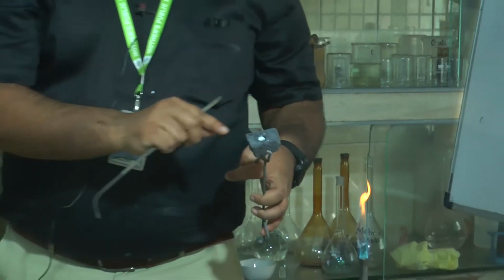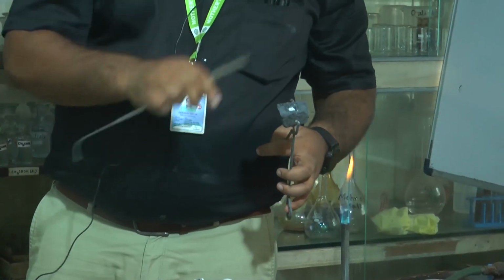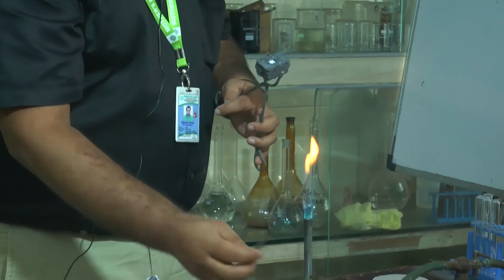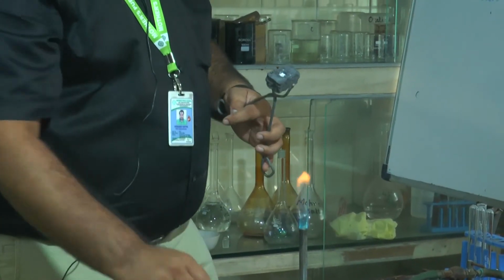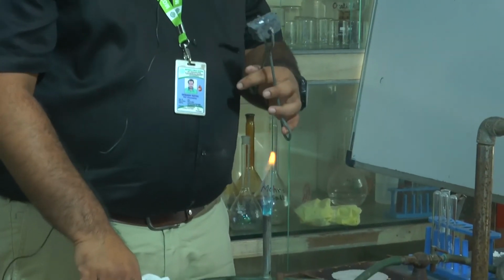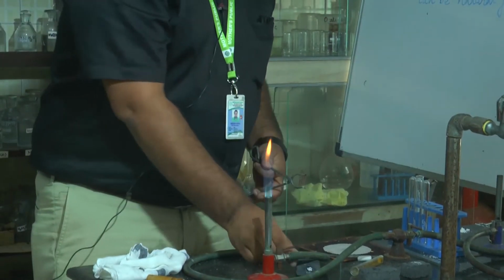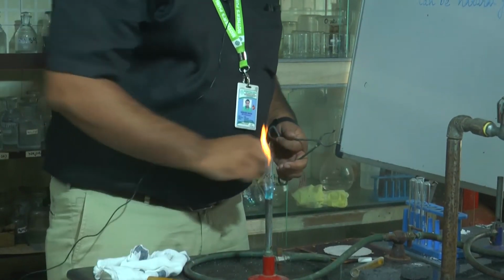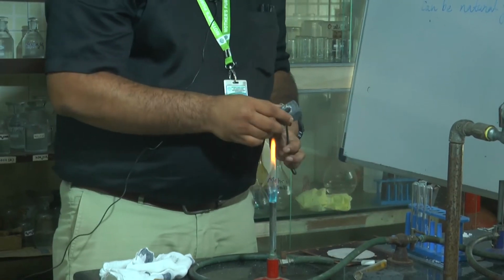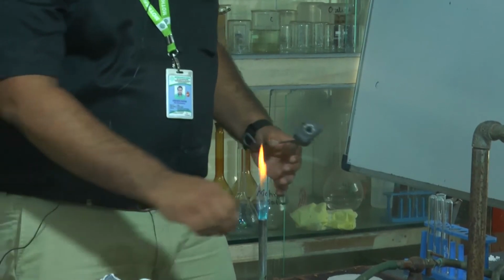And when some residue is left in this charcoal block, we will go for its cobalt nitrate test. We will go for the cobalt nitrate test if any residue is left. Okay, so I will show that cobalt nitrate test again. I am taking another salt.